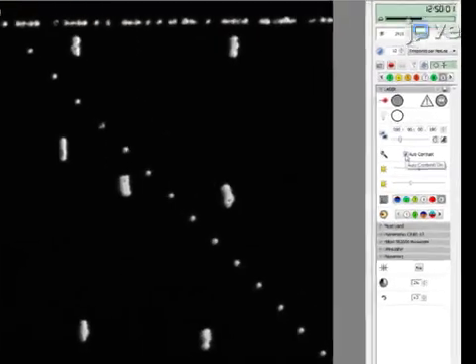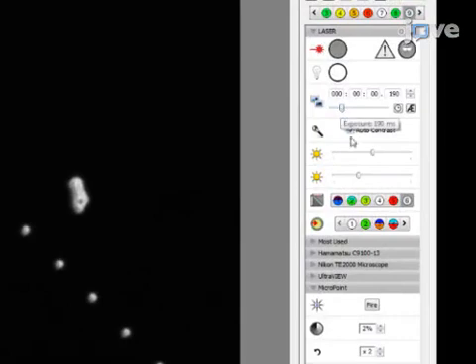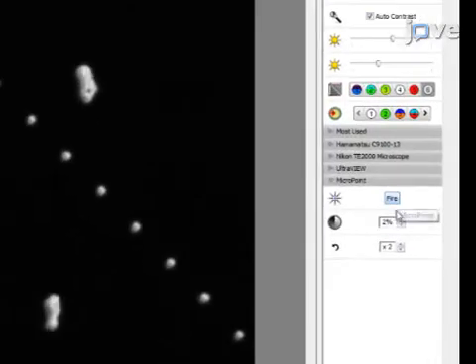Find a field on the slide that has been previously etched. Set the exposure time and laser power, then adjust the focus to move to a nearby non-targeted field on the mirror slide.